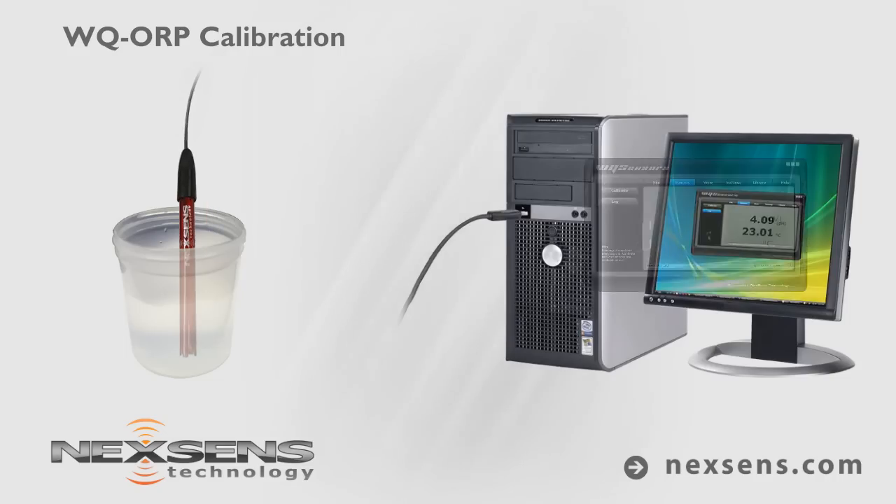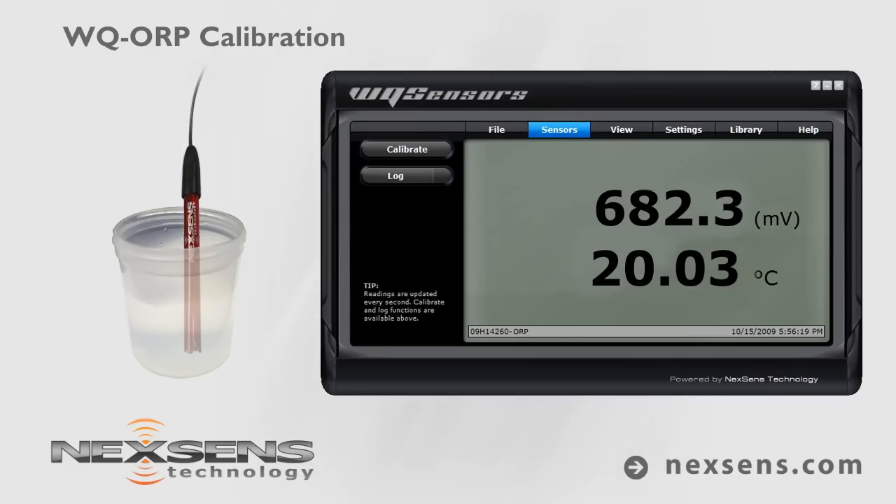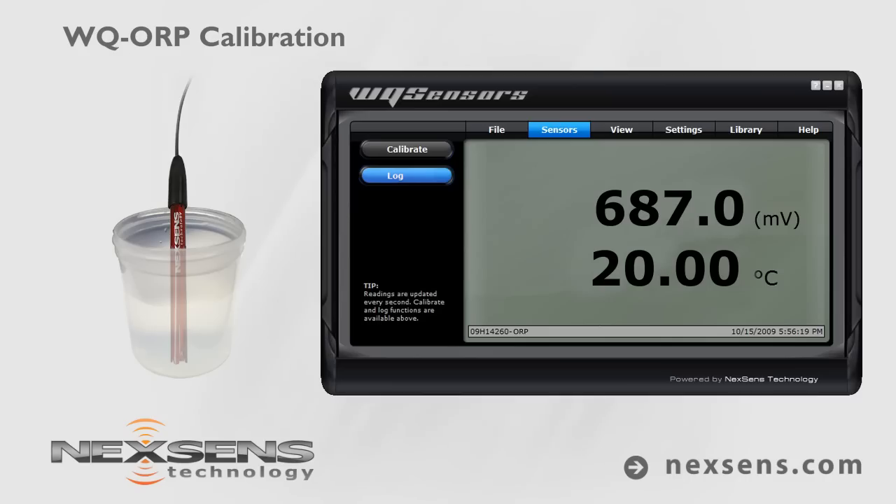When the temperature and millivolt readings stabilize, the measurement is complete. Press the log button to store the readings with a date and time stamp.